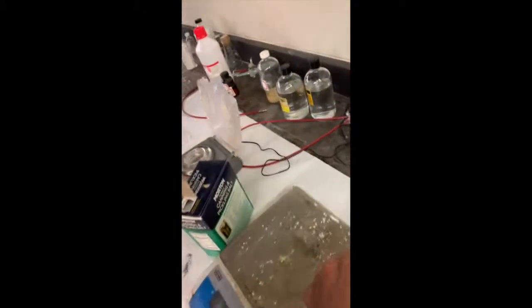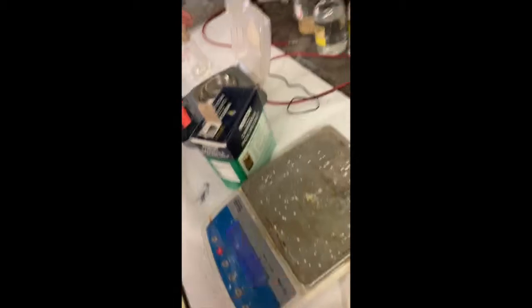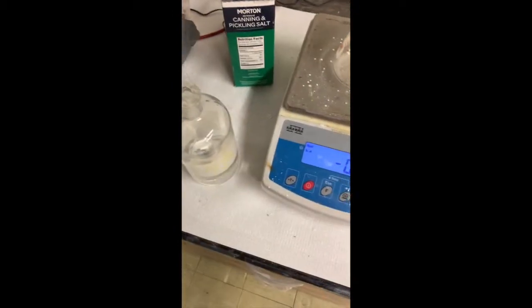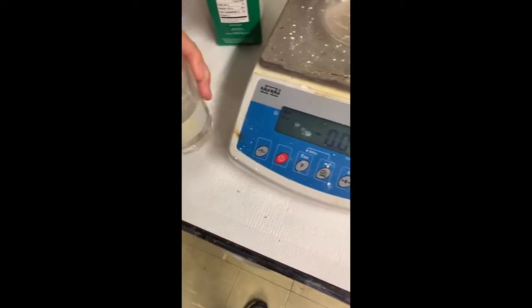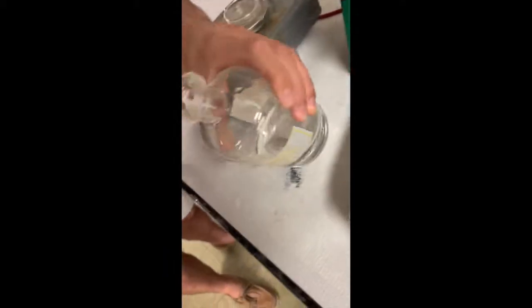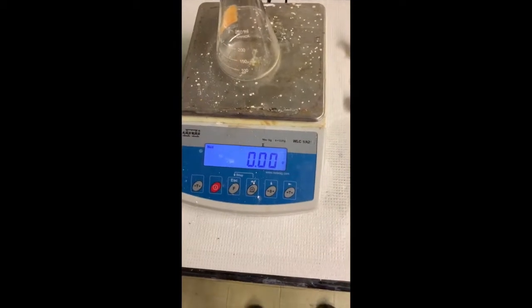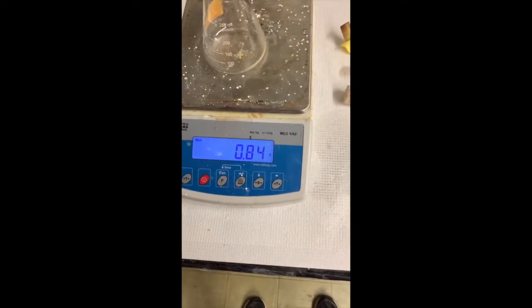Now we're going to take our Erlenmeyer flask and the sulfuric acid over to this scale. So here we are — we're going to put our sulfuric acid in a beaker, tilt it a little bit. All right, we just need 3.4 grams. Boom, there you go. Science.